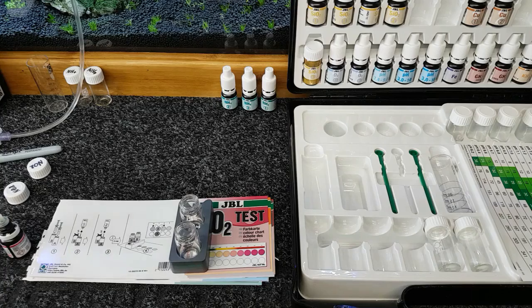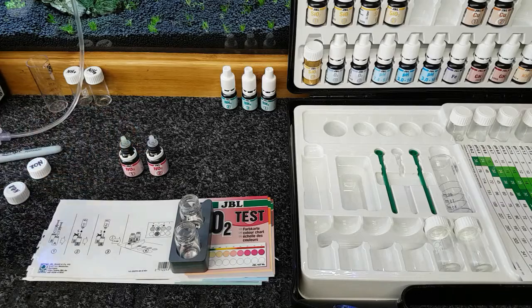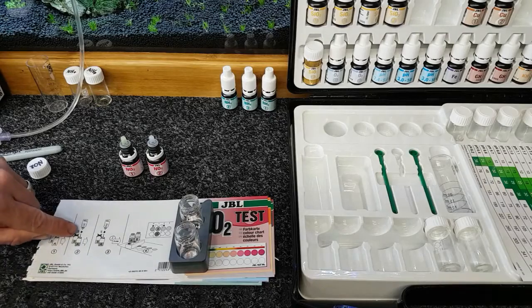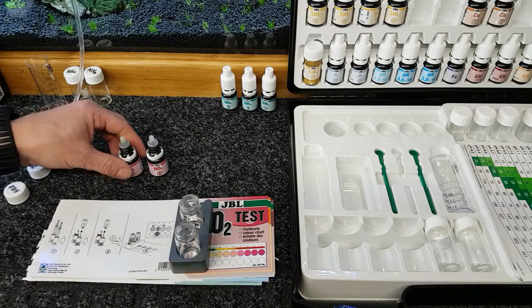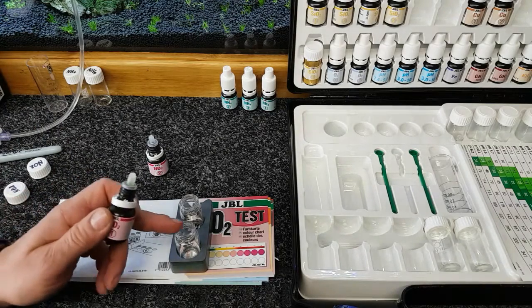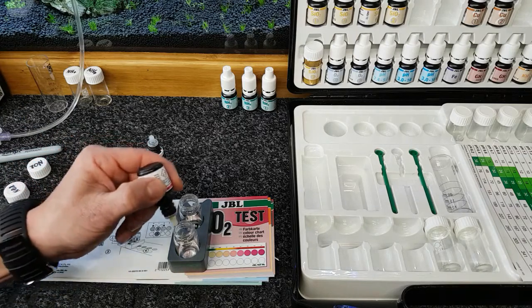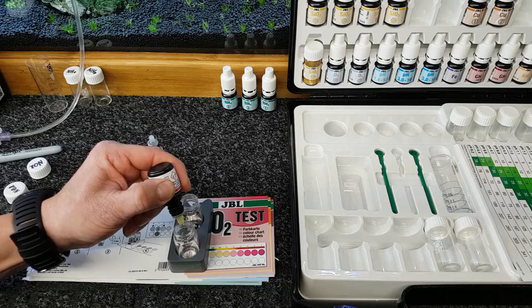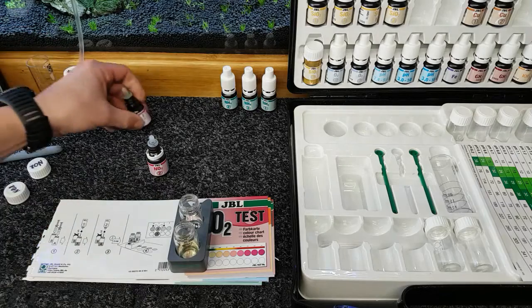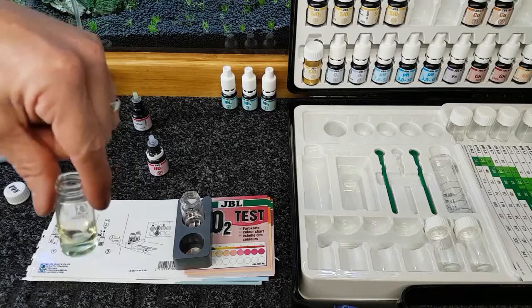Right, so as we did before, shake them up nicely. Number 2 there and number 1 there. Right, now we need 5 drops in our vial, which is going to be the nearest one to you. There you are, there's 5 of those. Take him out, swirl it around. As you can see, it's kind of yellowy colour.